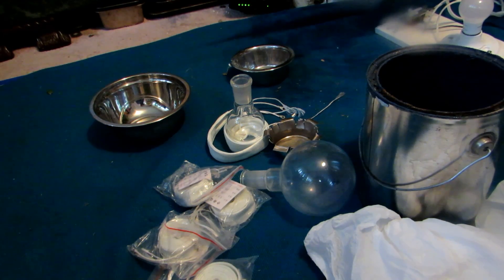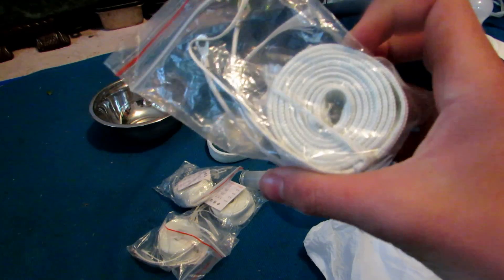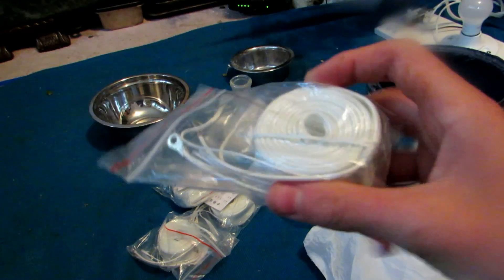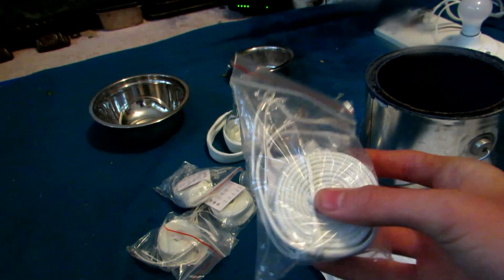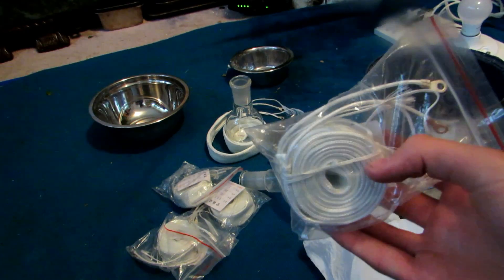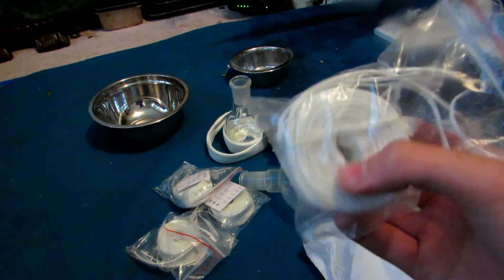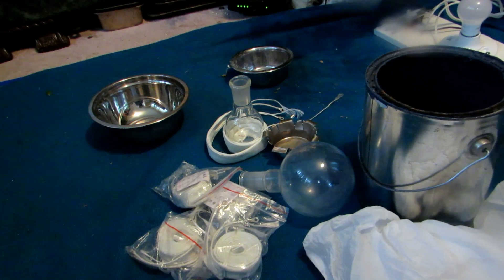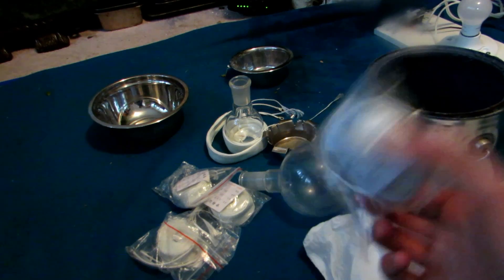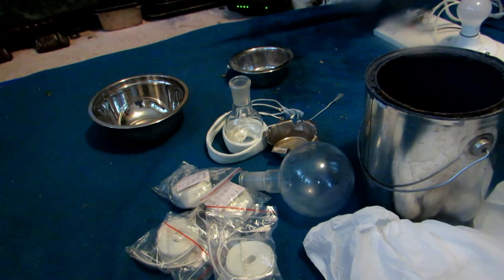These heating tapes, which can reach up to 700 degrees Celsius, can be bought online at websites like AliExpress for about a buck fifty Canadian. They're really cheap. You'll occasionally find them on eBay also, but you'll definitely find them on AliExpress. These high temperature heating tapes do indeed go well over 500 degrees Celsius.